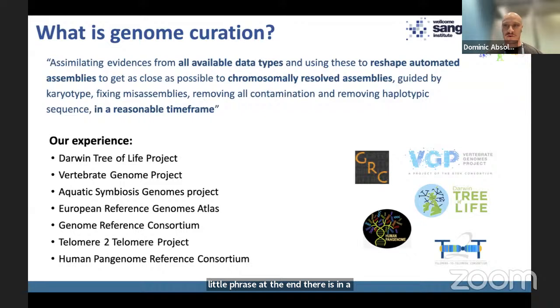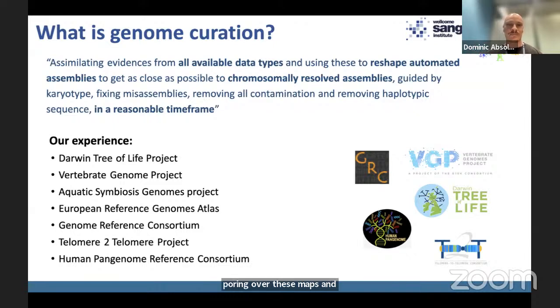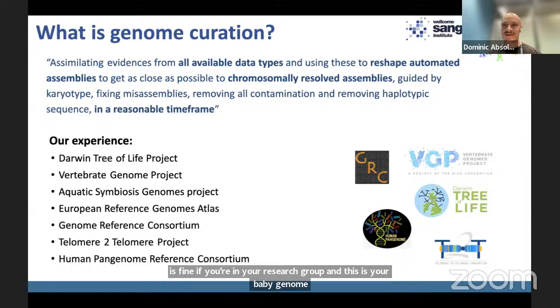Now, if any of you have ever seen a Hi-C map or worked in PretextView, let me tell you, you can spend hours and hours, if not days, weeks, months, poring over these maps and making tiny little adjustments, which is fine if you're in your research group and this is your baby genome, and you're really precious about it, spend as long as you like.